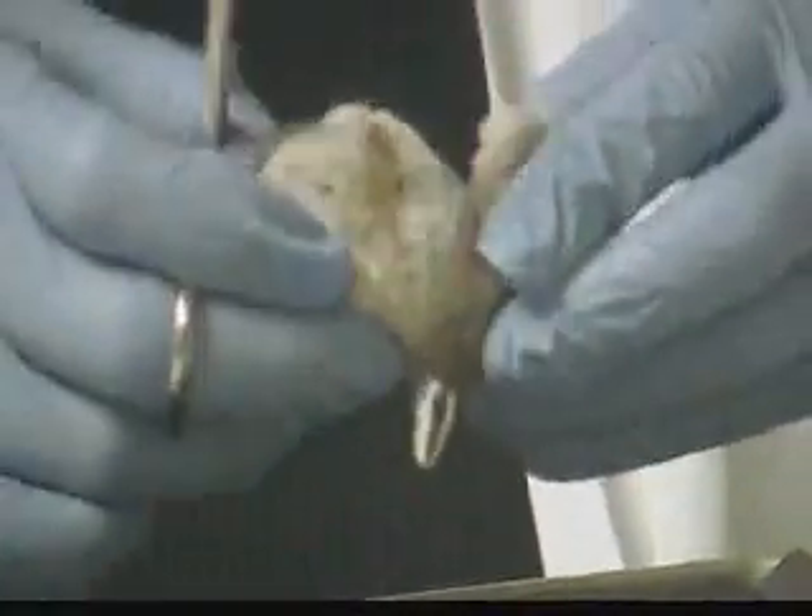I also have some vitreous humor. Vitreous humor is this gel-like substance that maintains the shape of the eye and holds the retina firmly against the back of the eye.